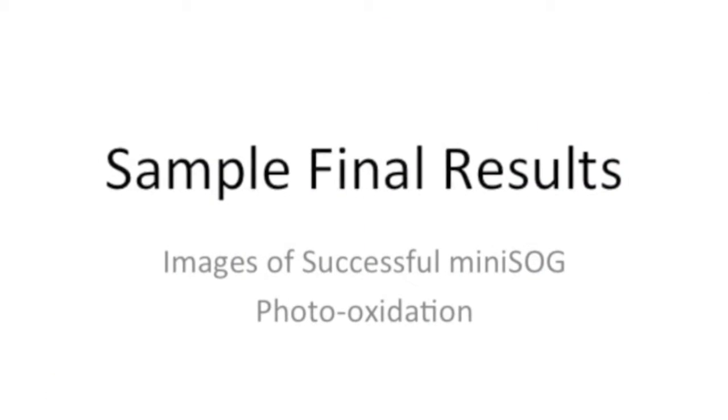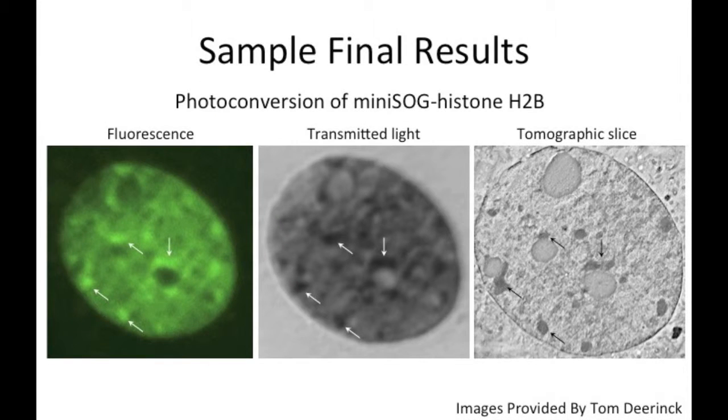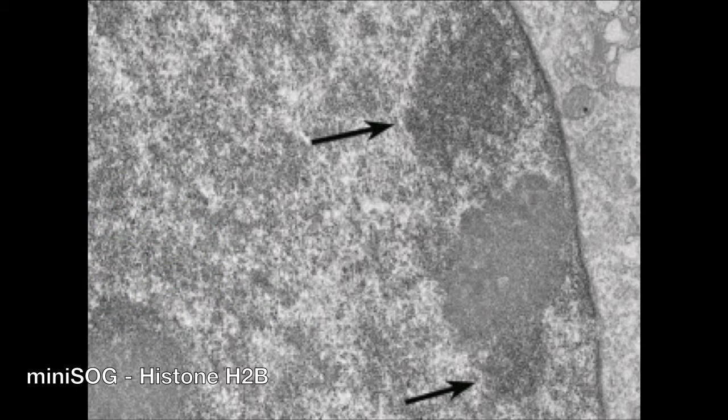Here we will show some examples of successful miniSOG photooxidation. Histone 2B, one of the main histone proteins involved in chromatin structure, was tagged with miniSOG. As expected, miniSOG fluorescent signal was observed in the nucleus. Note the areas of high signal density became the darkest after the photooxidation reaction. Here, at high magnification, where normally the nucleoli would be the most electron dense, we can see this very fine granular stained material representing the H2B in the nucleus.